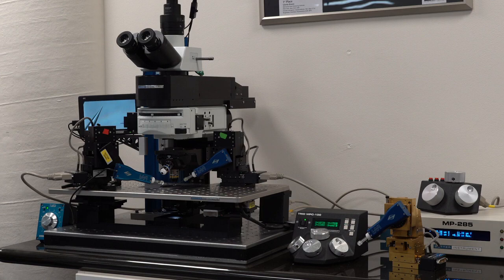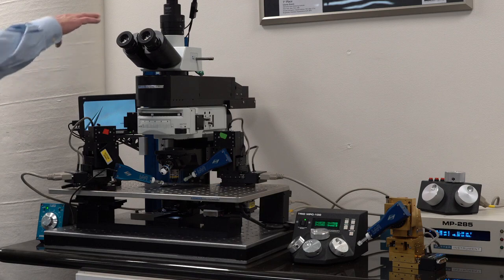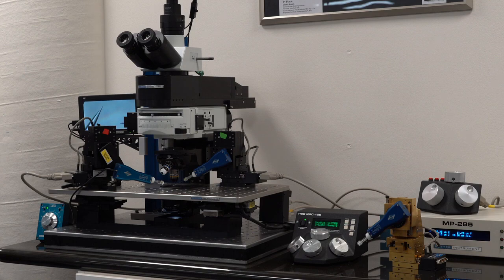I want to further emphasize that all the scan boxes developed for the MOM can be mounted on this horizontal surface in the back and used in the Bob 2P or the DF scope. That includes the new RGG scan box. In fact, the first RGG scan box we sold was installed in a Bob 2P at Thomas Bodden's lab at the University of Sussex in the UK.